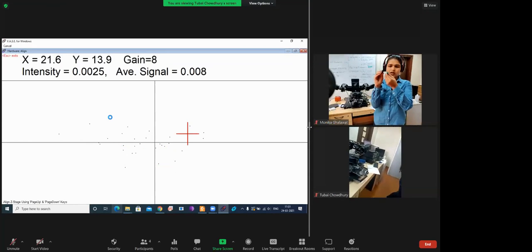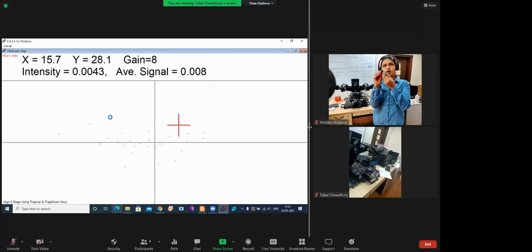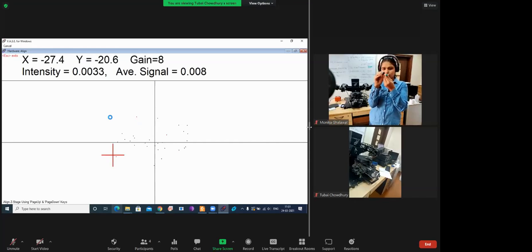It's not inside that, or not even coming on the edges of the black spot. That's why we are not getting any dark gray area rectangle. So what we have to do is move that white spot so that it can go inside the black spot.